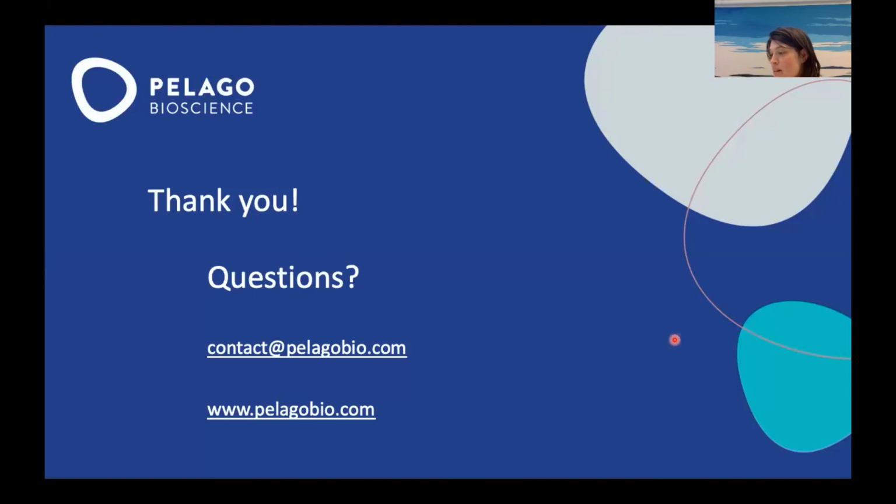The first question was regarding if there's no antibody available for detection. I guess this was early in the webinar before Alexei had presented the proteome-wide MS-based format. So yeah, of course you could study your compound using the CETSA Explore to identify targets. But also if you have a specific target of interest, but there's no antibody available, one can also consider maybe doing a targeted MS format, something we have started to look into at Pelago.